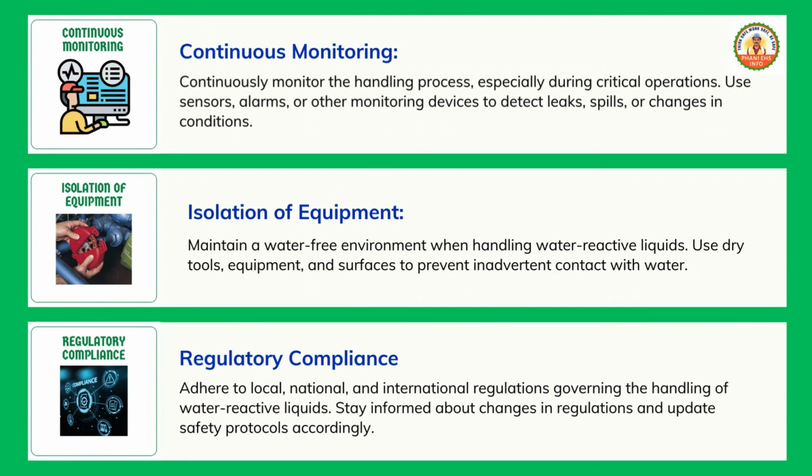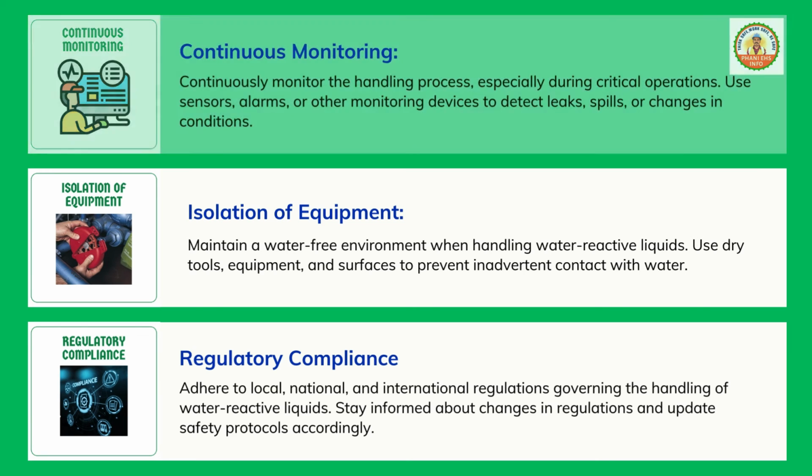Regulatory compliance. Adhere to local, national, and international regulations governing the handling of water-reactive liquids. Stay informed about changes in regulations and update safety protocols accordingly.